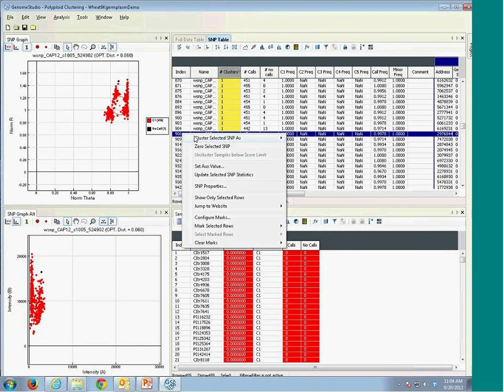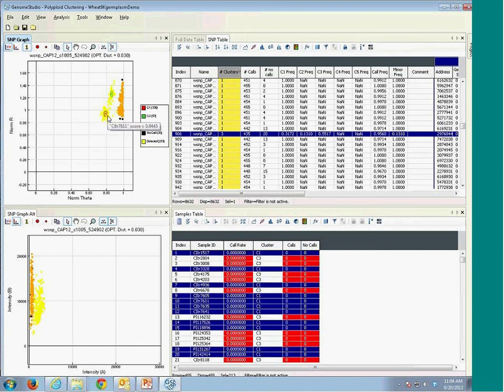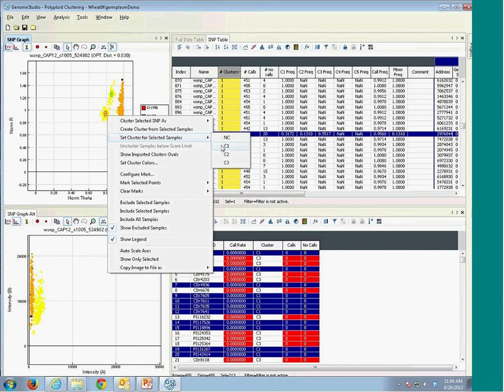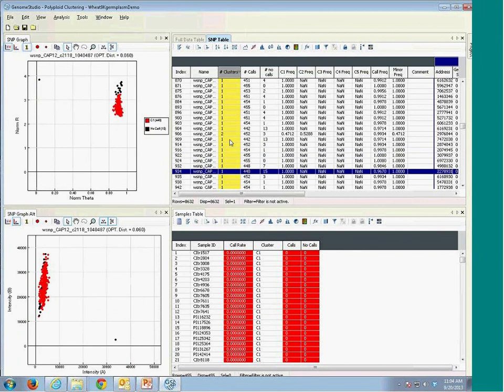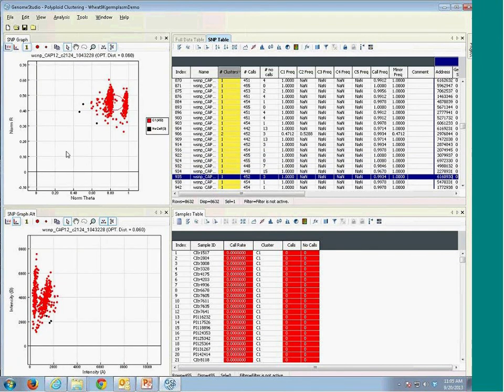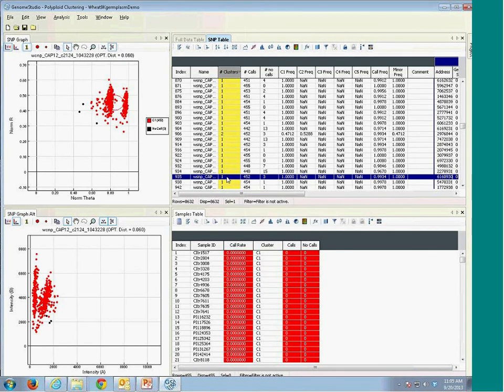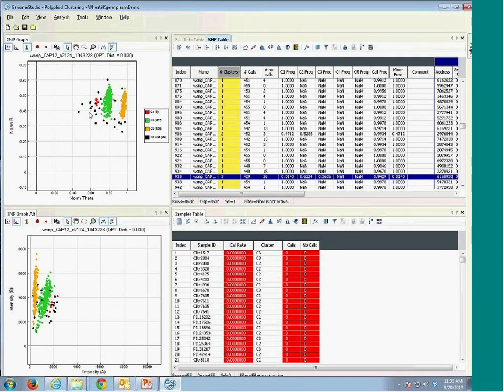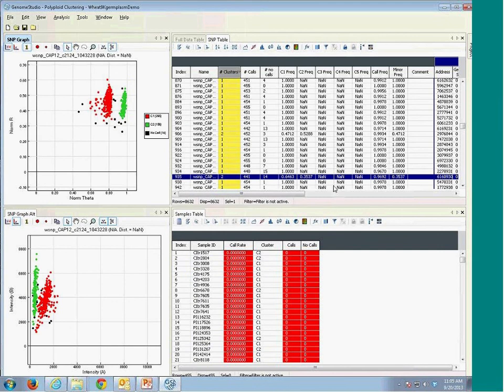Let's have a look, and then we'll go ahead and do the OPTICS clustering. Here now I got 3 clusters, and I think those 2 probably should belong to the same cluster, so I assign this to the first cluster. And here we go, we have 2 clusters. You can find another example like this, and I'm just going to use the same parameter and hit the letter O on my keyboard. Again, here we see a very nice 2 clusters, and these samples could probably belong to the same cluster. All right.